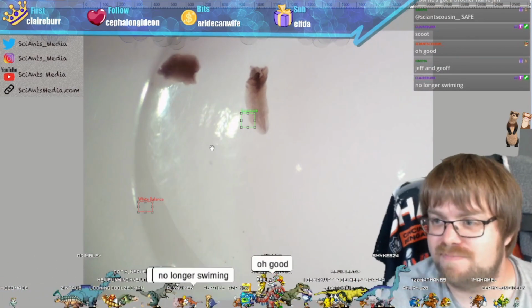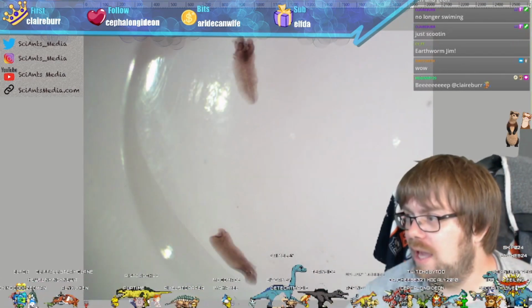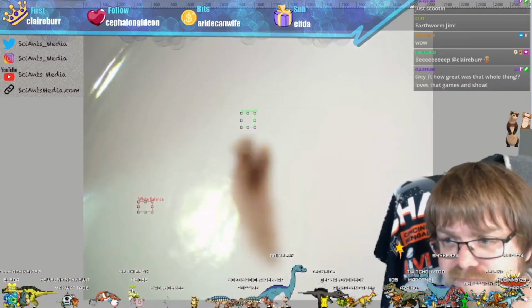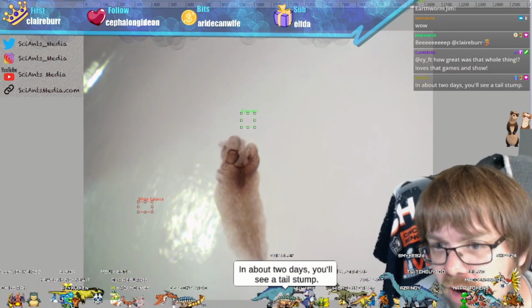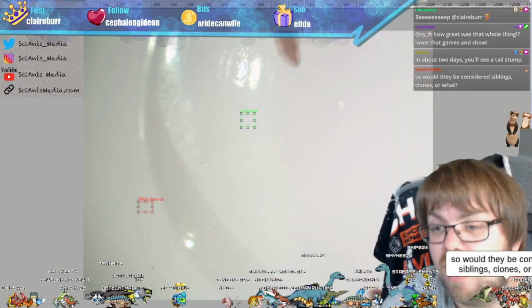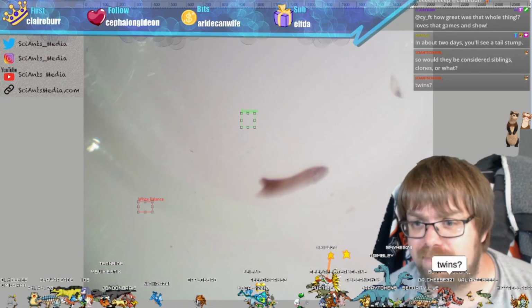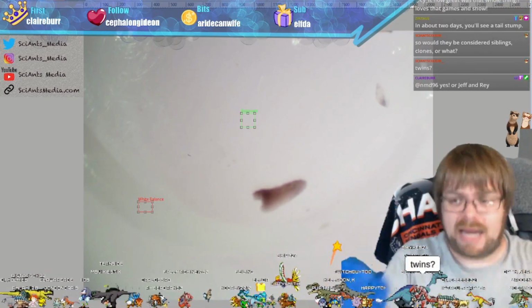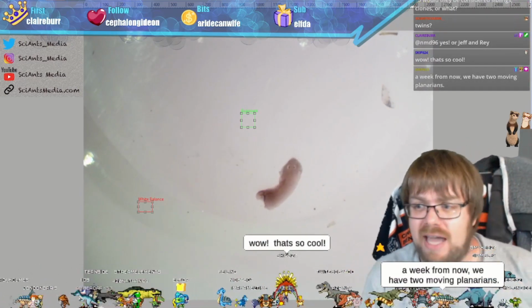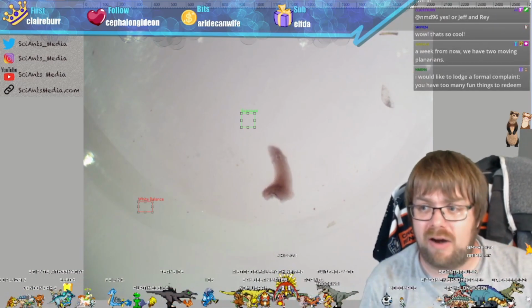I'm actually going to take a picture. And that's it. He is going to regenerate, so you can actually see on the tail portion, it's already cauterized and fixing it up. So great question, Theo. It is clonal. Closer than twins because they're genetically identical. And then this part of Jeffrey will start to form a tail. Yeah, in a week we'll have two moving Planarians, two brand new Planarians here.